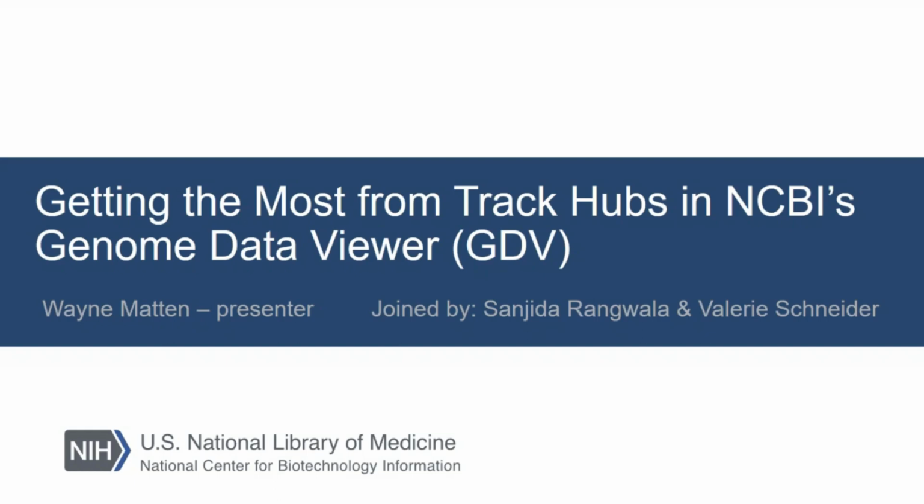So the idea today is in part to advertise the fact that we now have Track Hubs available in NCBI's genome browser, the Genome Data Viewer, and give some demonstration of how to find Track Hubs and then how to connect to them and see what they look like in the displays.